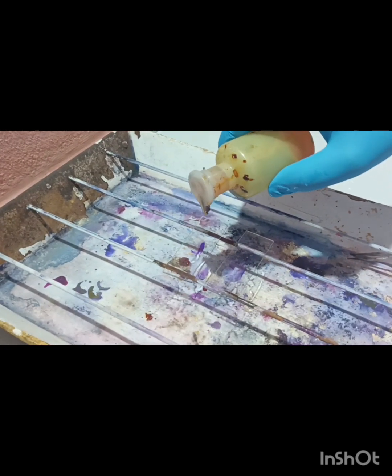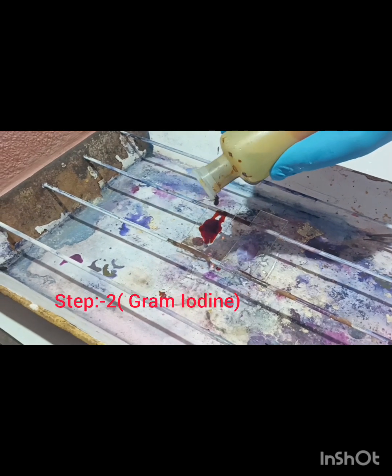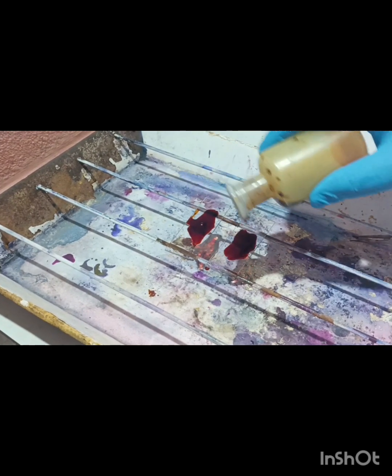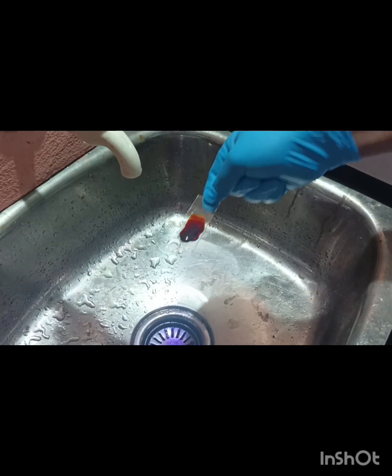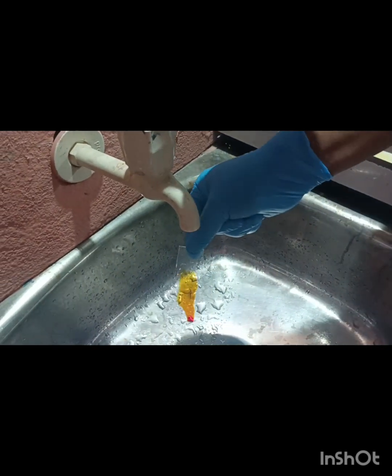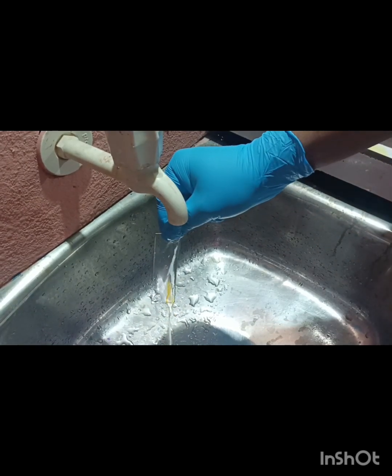After primary staining with crystal violet, we have to put Gram's iodine and we cover only the smear area, and it also is held for 1 minute. After 1 minute with Gram's iodine, we discard it and wash properly with tap water, same like before.